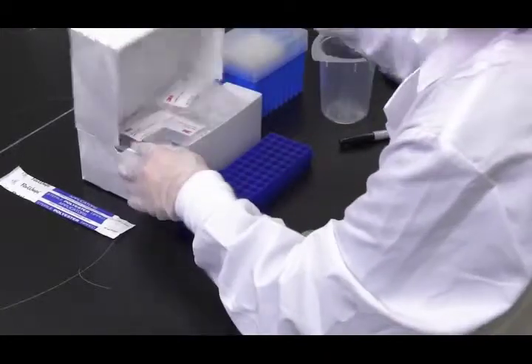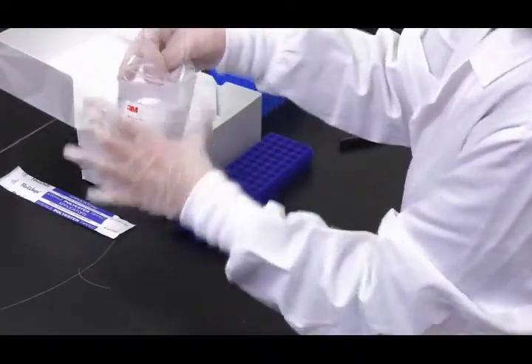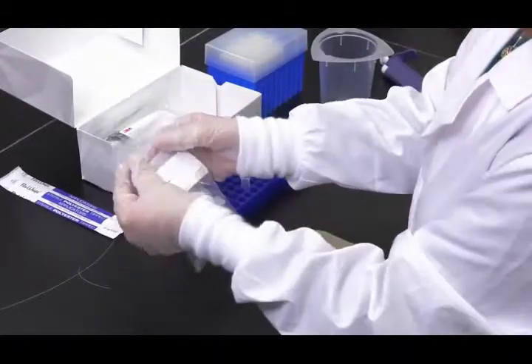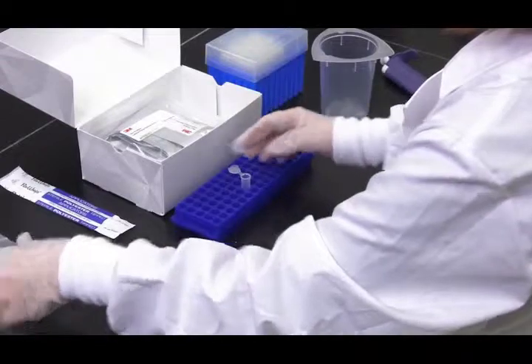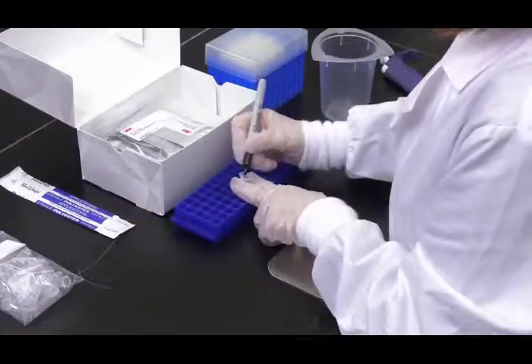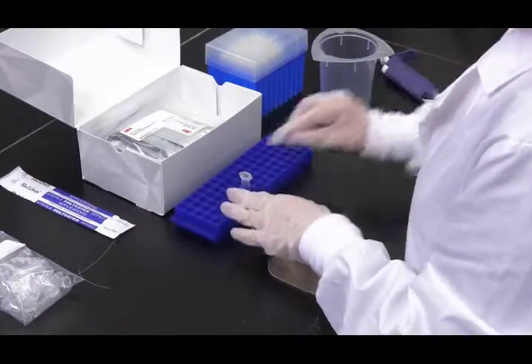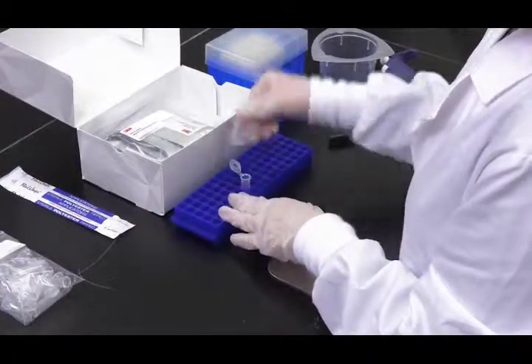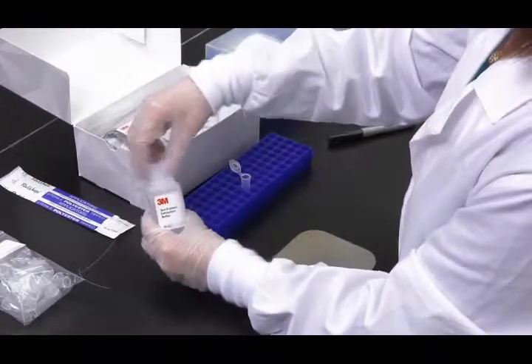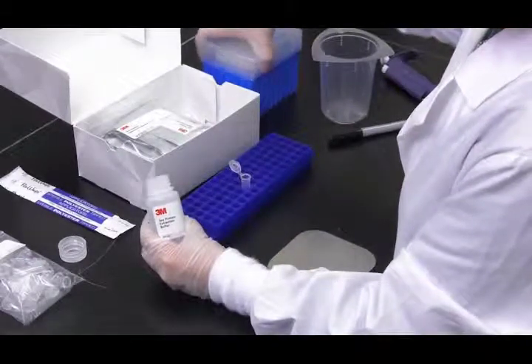For analyzing environmental swab samples, first label one microcentrifuge tube for each sample. Then add 500 microliters of 3M extraction buffer into a labeled microcentrifuge tube.